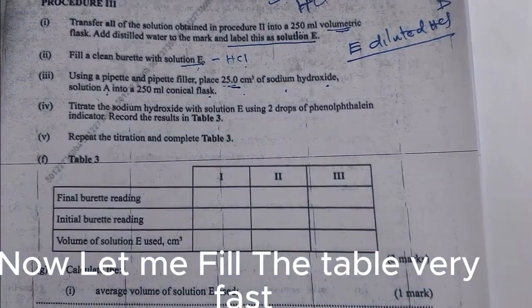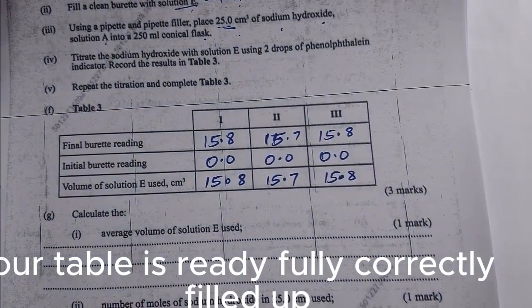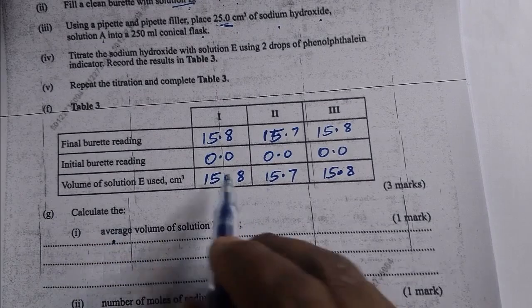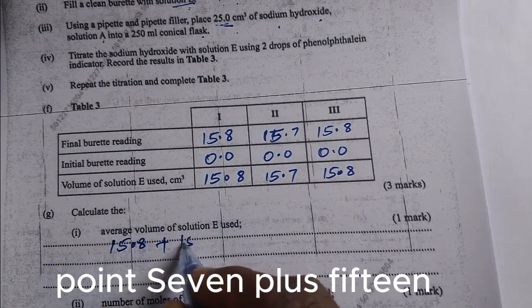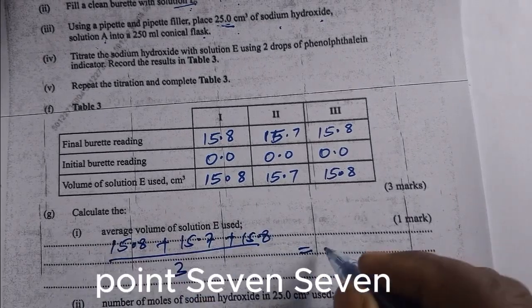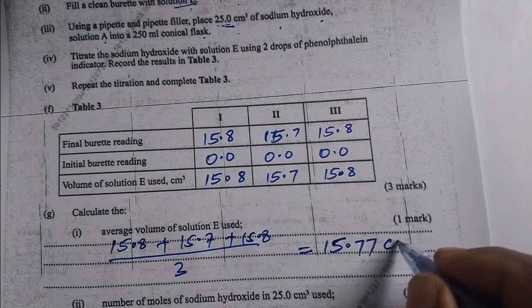Now, let me fill the table very fast. Our table is ready, fully correctly filled up. So calculate the average volume. Average volume, we'll use 15.8 plus 15.7 plus 15.8 divided by 3. And the answer is 15.77. Make sure your answer is 2 decimal places for the average.